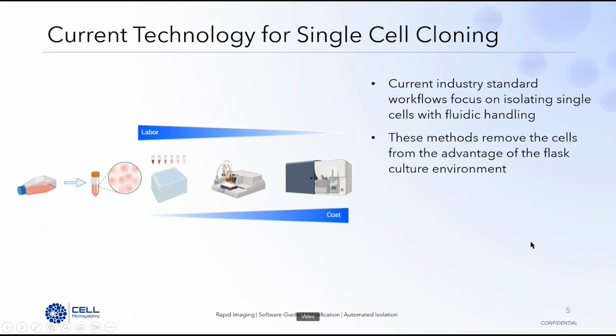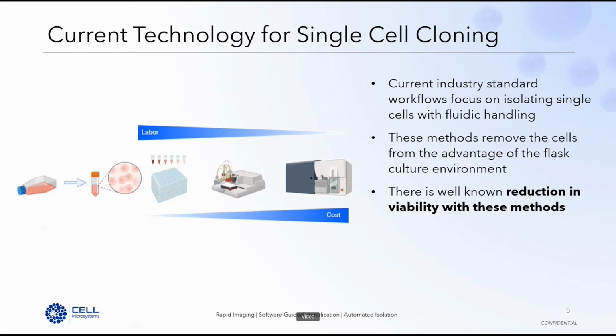But what's critical about this is that these methods ultimately remove the cells from all of the advantages of the flask-like culture environment, namely shared media, the benefits of cell-cell communication, and the paracrine signaling that you get in that particular environment.